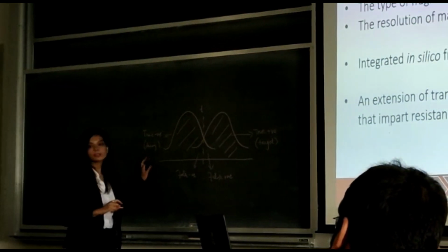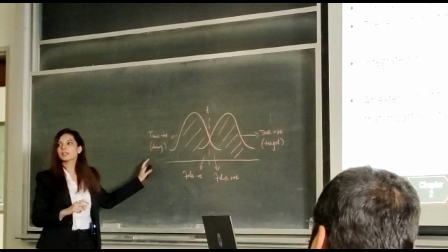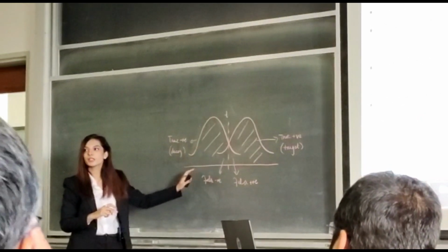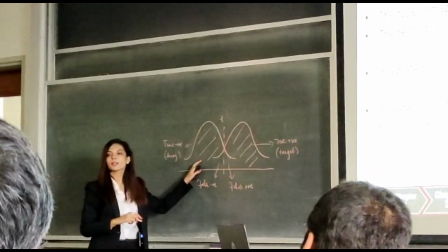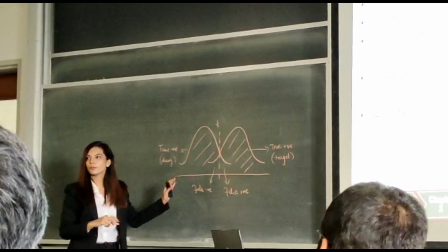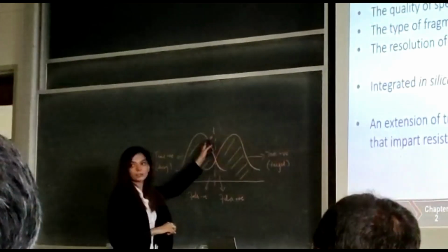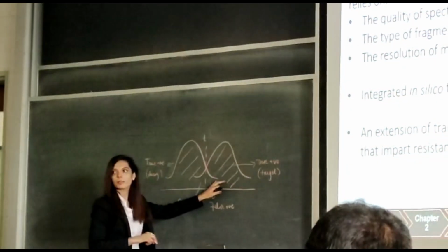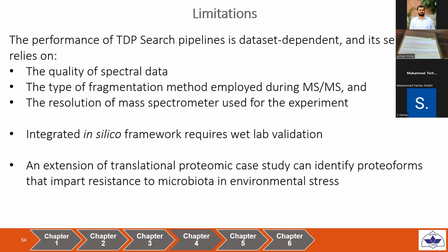Decoy, in this case, is the shuffled database that incorporates the spectrum. It also incorporates three types of mutations. So it's a very random DB. The chances of this random DB providing us with a proteoform identification should be very, very low. So this is the 1% FDR threshold. We allow for one false positive. This is the target DB, which is the protein database. So for every search, we set this threshold to be 1% FDR. We allow for one false positive identification, that is, of the proteins that we have identified, for one protein identification to be wrong.